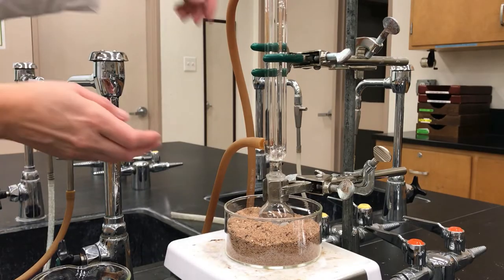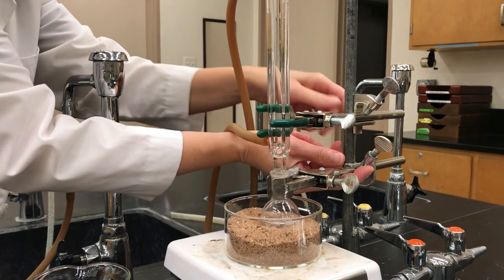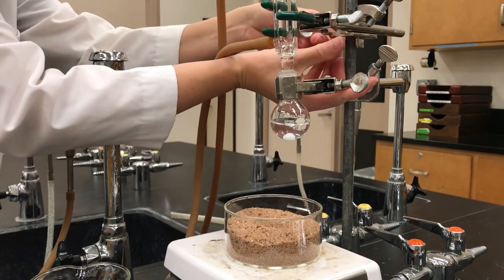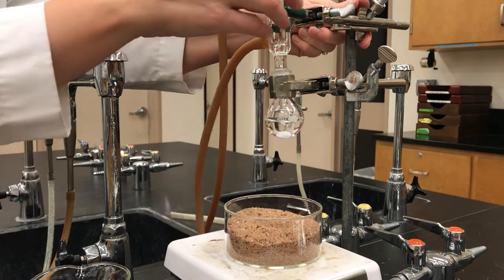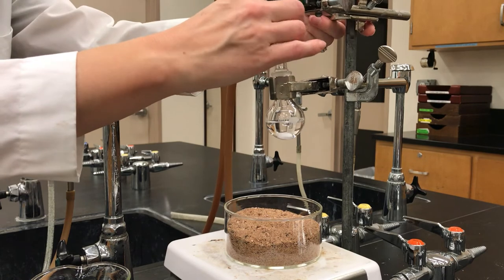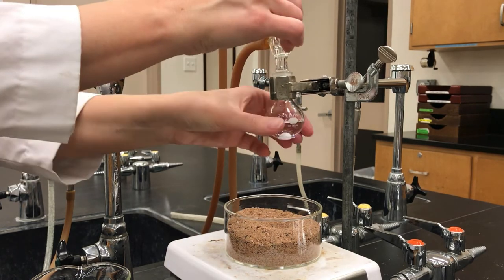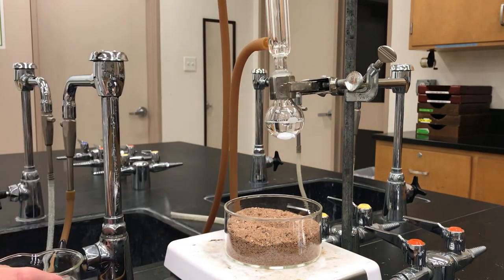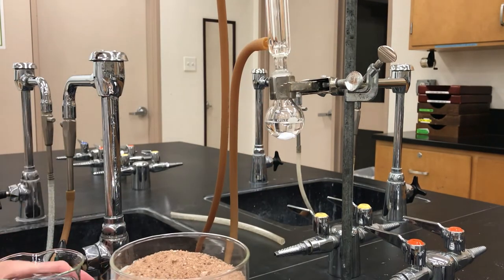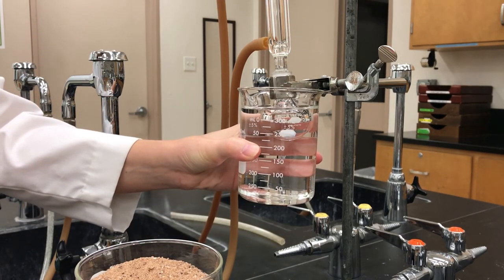When you're done with the reflux, then lift the flask out of the sand bath. And don't remove the condenser yet because everything's still hot. And if you want to move on more quickly, then you could take a beaker of water and surround the flask with this water to quickly cool it. And once it's cooled, then you can turn off the water and remove the condenser.